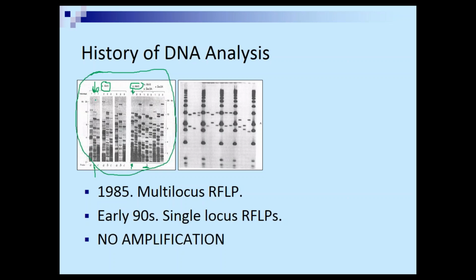And if you compare the second column here to the first column here, and I'm aware this picture is a little small, you can sort of see how there's a band, and then if you go down a little bit more, there's 2 bands, and then a little bit more, there's a thick band. And you'll notice that the pattern in those 2 columns matches. It's not a perfect match, but there's definitely the spacing and the number of bands there match.